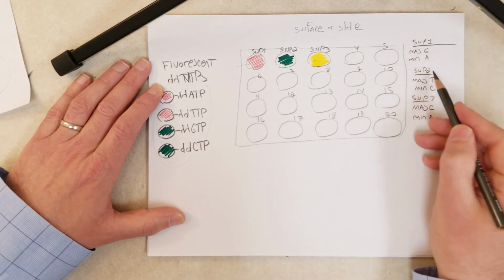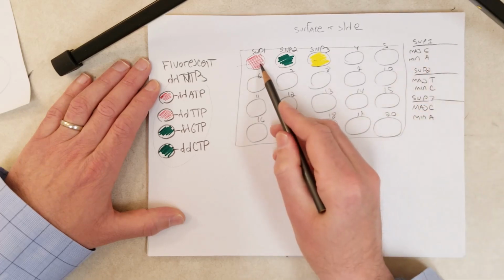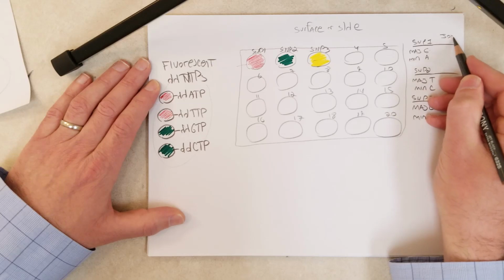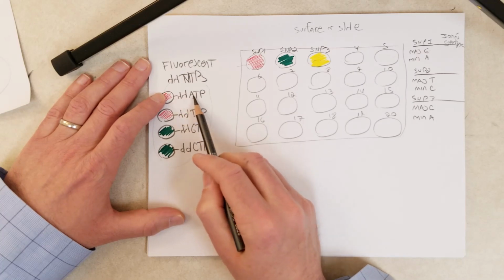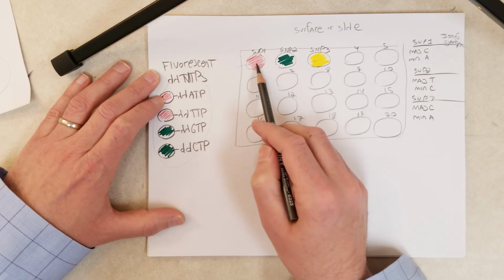So now, knowing that humans can be either G or A for SNP1, what can we say? What is John's genotype for SNP1? We know red is used for A and T, right? So we only see red here.